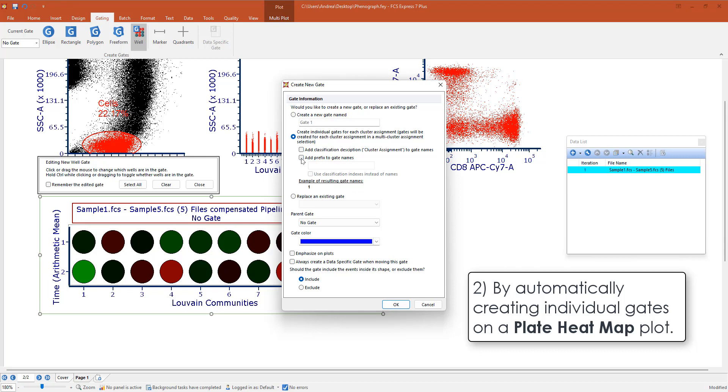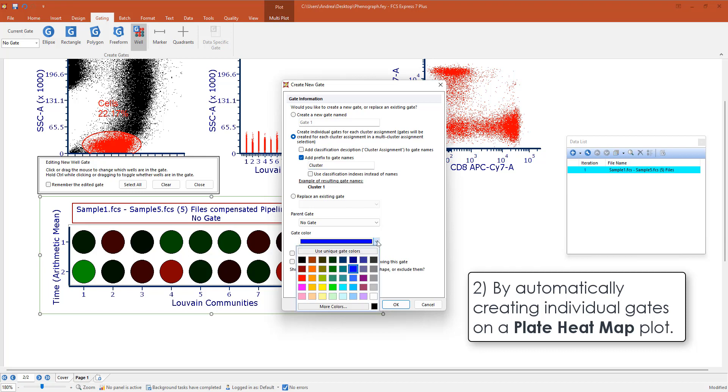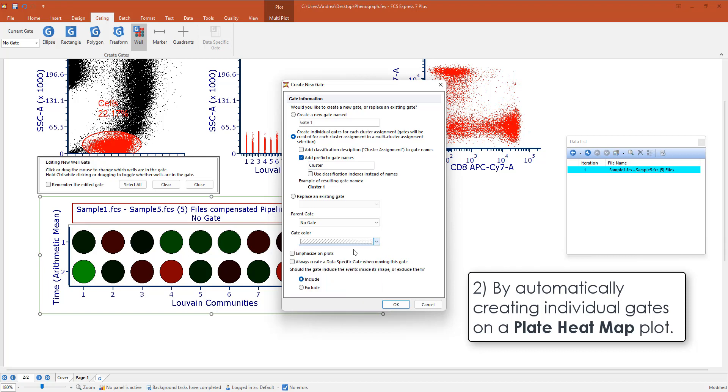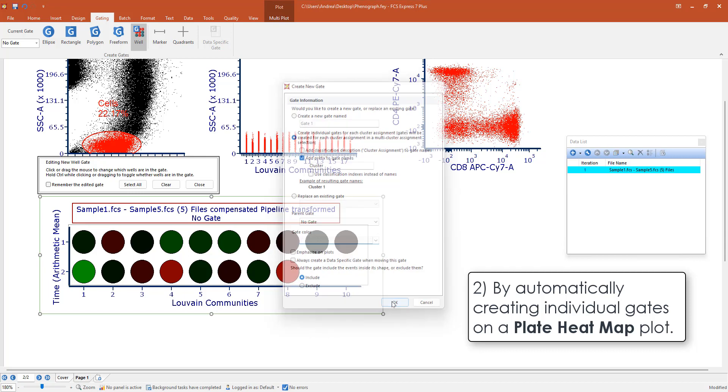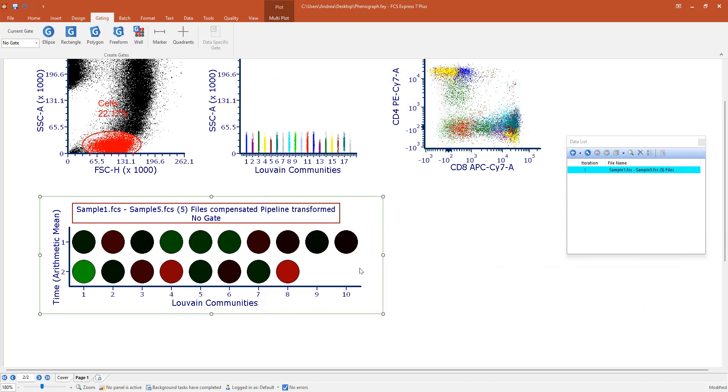You can add a classification. You can add a prefix. So let's say that we want to call each gate cluster and then 1, 2, 3, 4, and so on. We can also color each cluster gate with a unique color. And here we go. You see now every single cluster is colored with a different color.